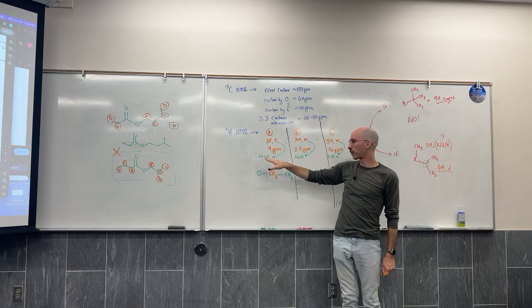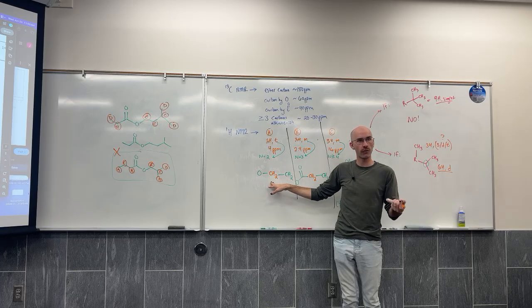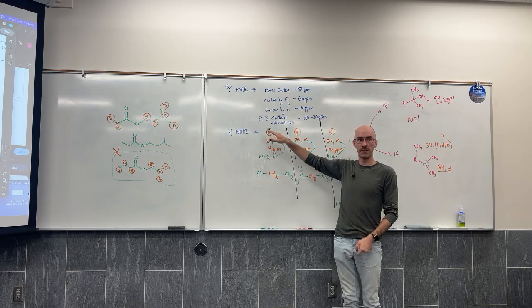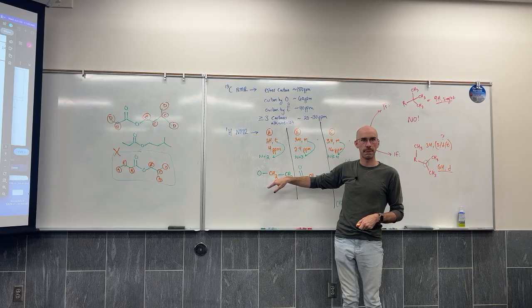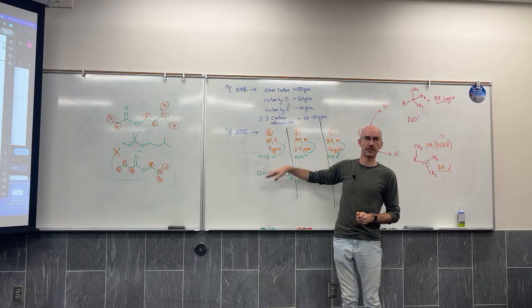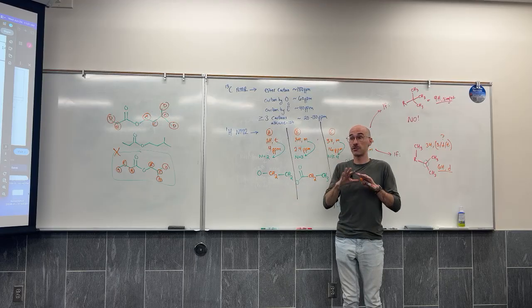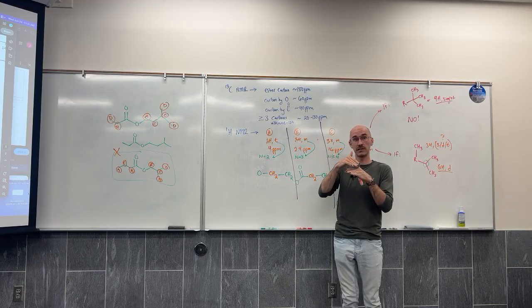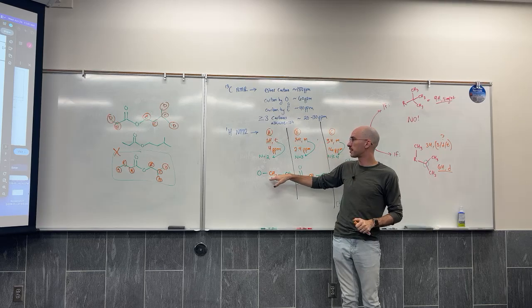which is why I had you interpret that as a CH2 group. Can you know for a fact that CH2 has a carbon? The signal is telling you H's, not carbons. But what else are they going to bond to? Carbon. Maybe a nitrogen, but nitrogens don't split. Hydrogens on nitrogens don't split their signals into peaks.